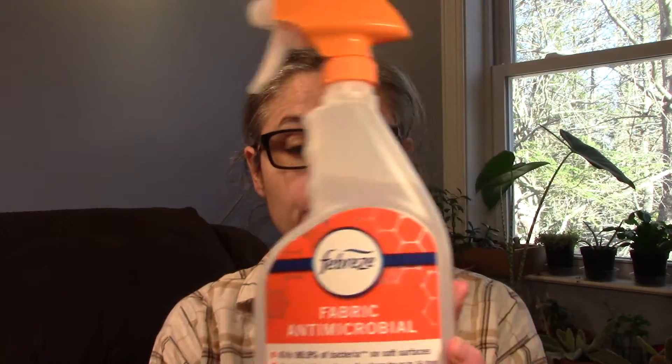A few weeks later I conducted a test where I used my Bissell Spot Cleaner as well as some Lysol Spray to see if we could remove some of the bacteria — I'll put a link to that video down below. But today we're going to test out Febreze Fabric Antimicrobial Spray. This is a sanitizing spray that claims to kill bacteria.